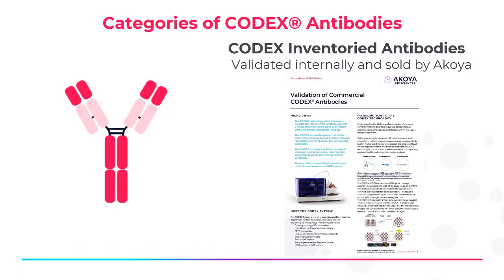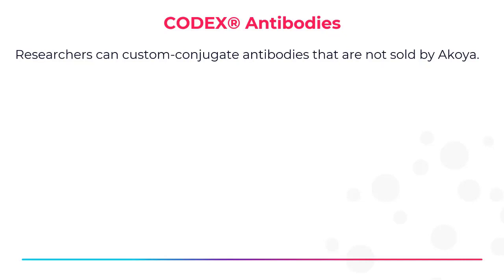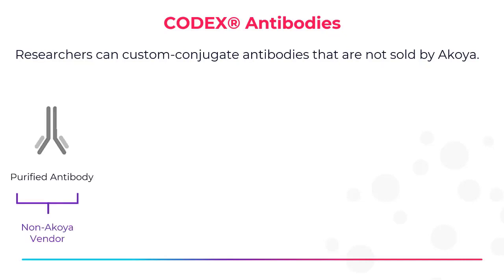Now, what can you do if your antibodies of interest are not sold by Akoya? We have a solution for that. What you can do is custom conjugate your own markers of interest. This next section will provide guidance on just that. So the first step in custom conjugating your own antibodies is purchasing a purified antibody from a non-Akoya vendor.